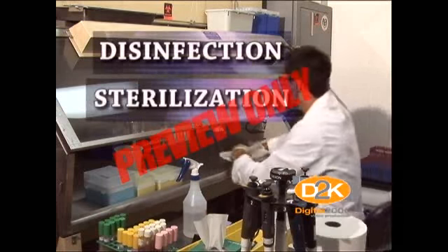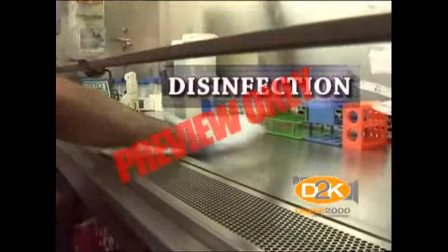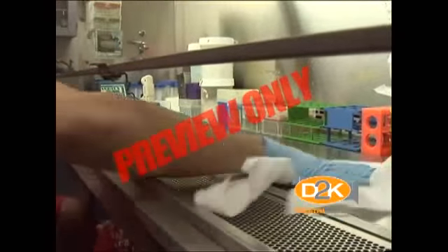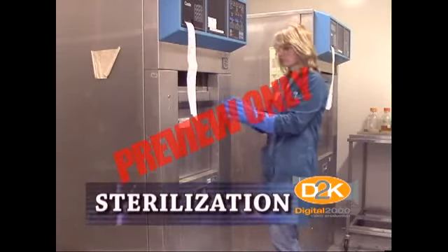Disinfection and sterilization are two ways to help ensure biological safety in the laboratory. Disinfection is the reduction of the number of pathogenic organisms by the direct application of physical or chemical agents. Sterilization is the total destruction of all living organisms.